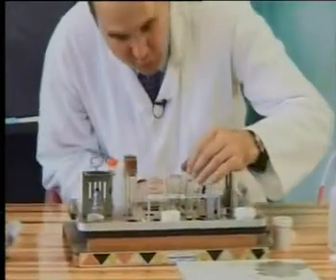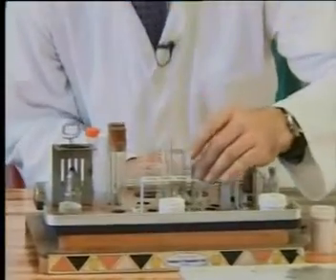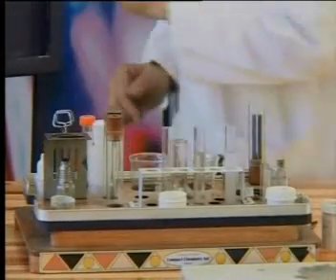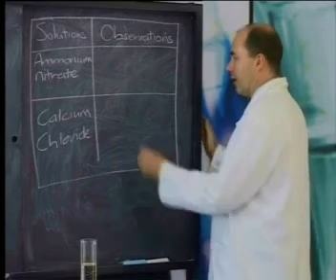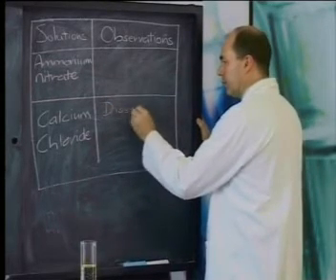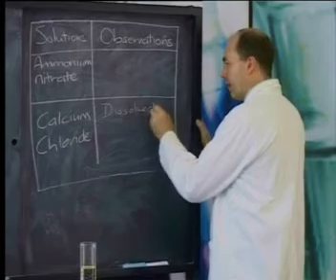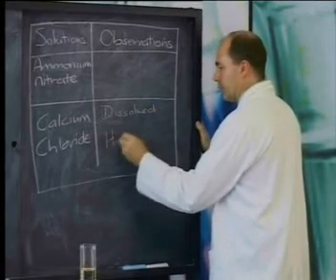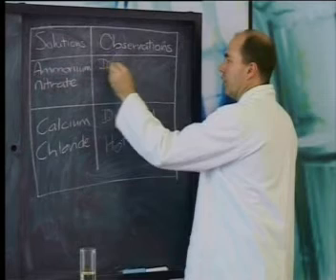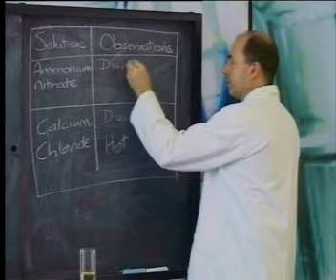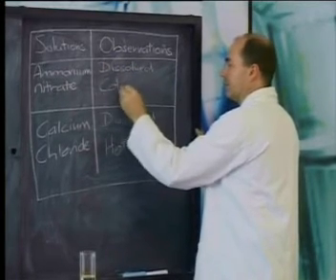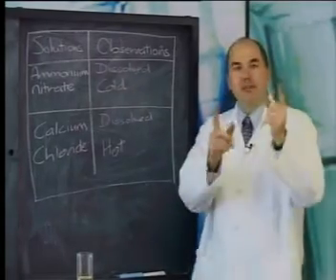Now watch what happens when I mix ammonium nitrate and some water. The ammonium nitrate has all dissolved and the test tube is getting colder. I'm going to record my observations. The calcium chloride dissolved in water and it became hot. While the ammonium nitrate also dissolved in water, but it got cold. Back to you, Diasa.